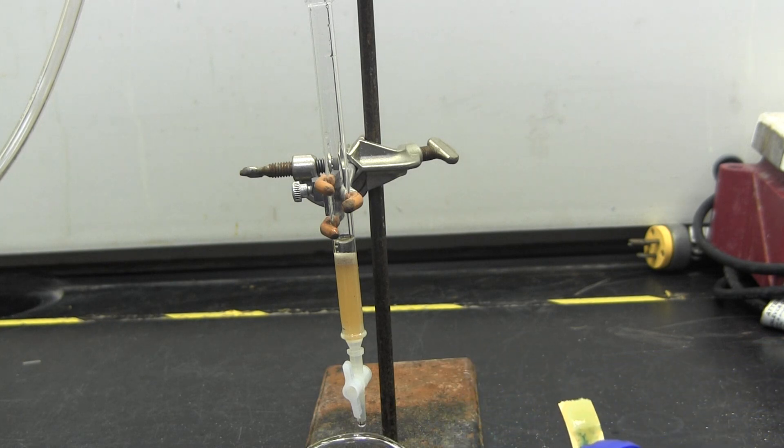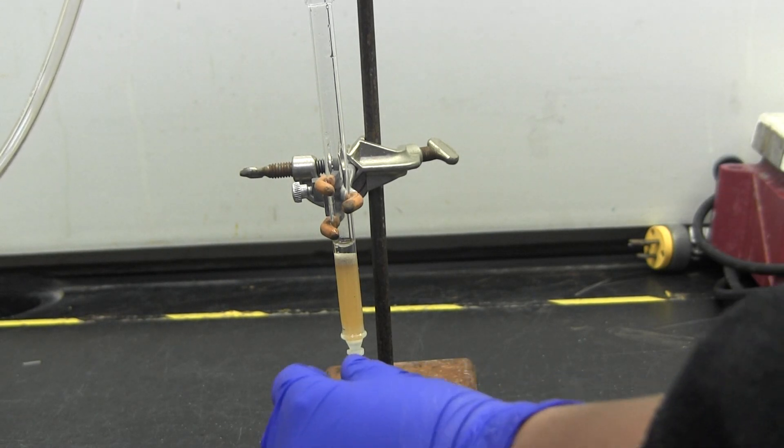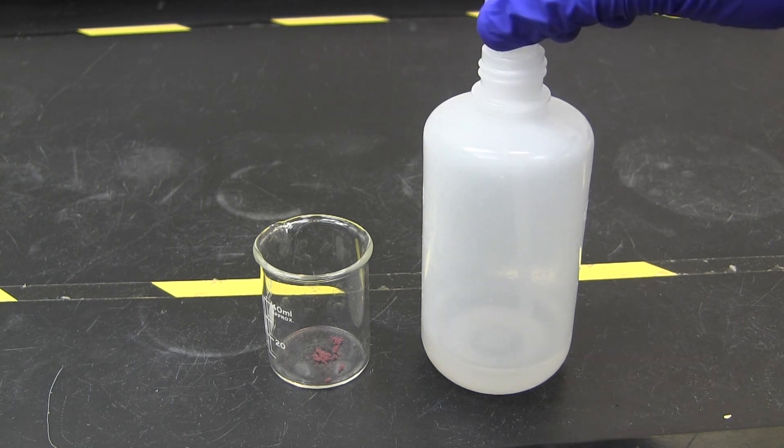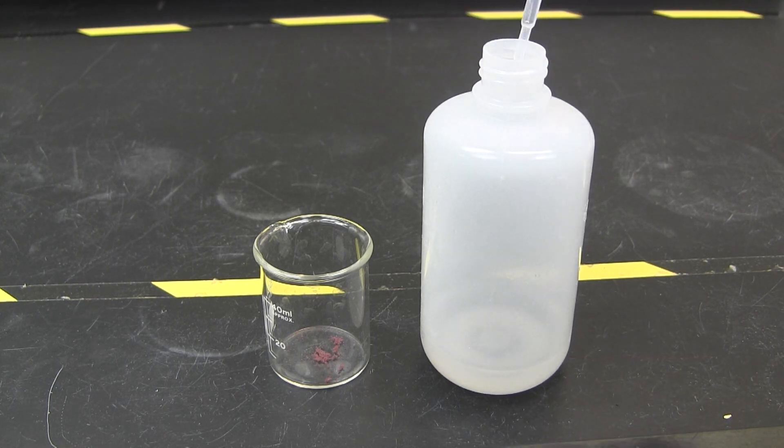Check the pH of your elutin once you have run the water twice. If the elutin is not neutral, run another column full of water and check again. Once the pH is neutral, lower the liquid in the column down to the sand.